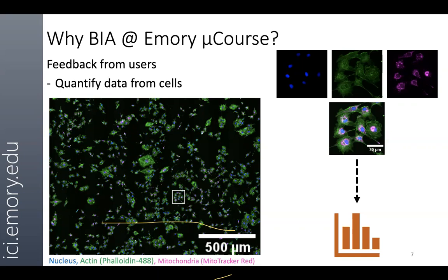So why do we need a course such as this? We always get feedback from users, and one of the biggest is, well, we have a lot of data, what do we do with that? Most of the time this discussion happens towards the end of the imaging session. So we thought we really need a course up front where you can think about the aspects of image analysis, and hence the planning of experiments, not just at the bench, but also when you come onto a microscope.